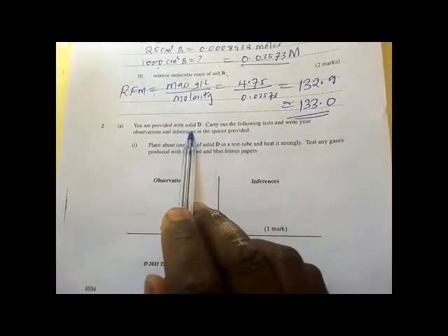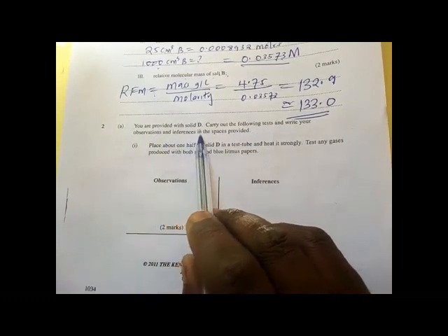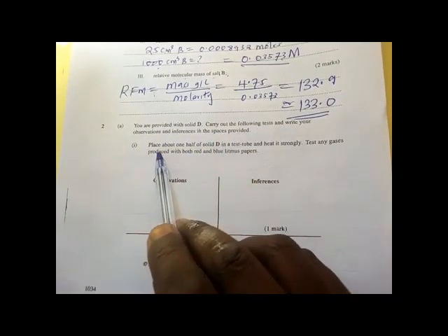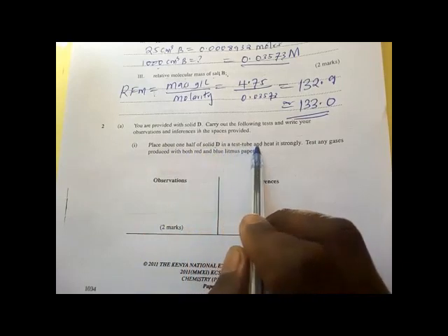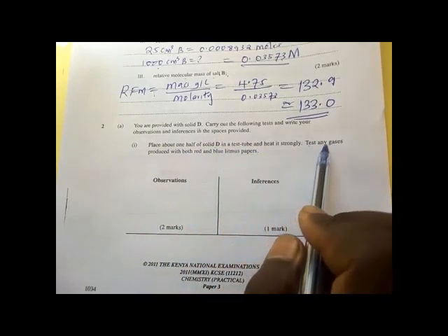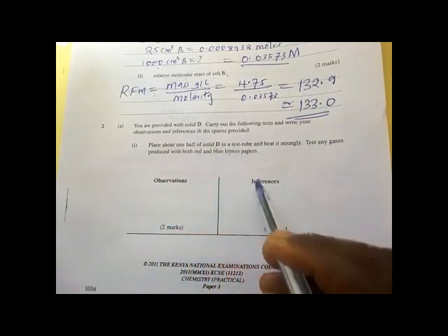You are provided with solid D. Carry out the following test and write your observations and inferences in the space provided. Place about 1/2 of the solid D in a test tube and heat it strongly. Test any gas produced with both red and blue litmus papers.